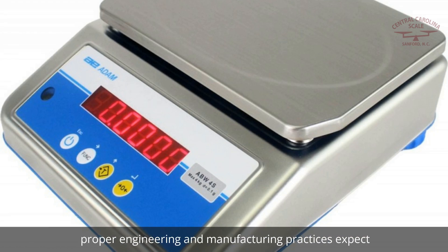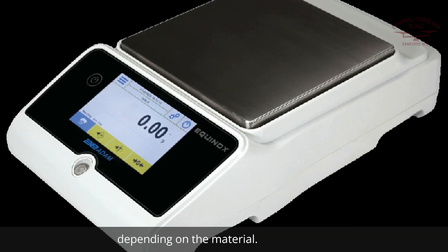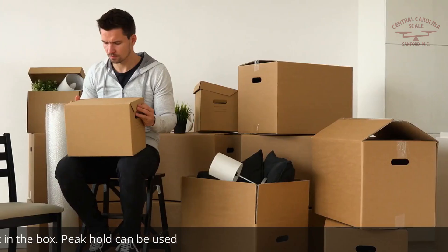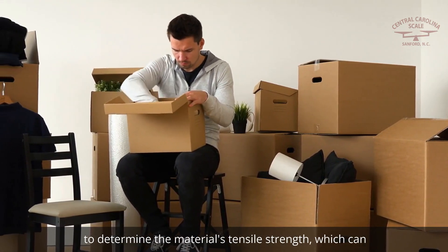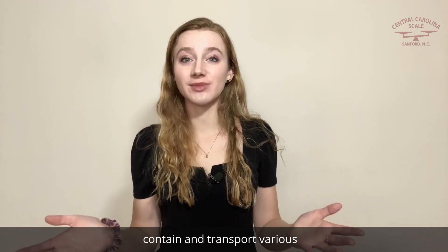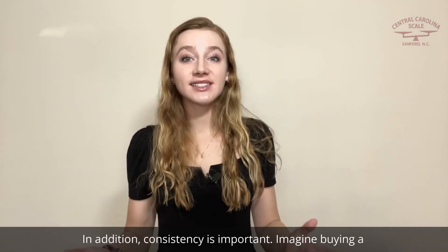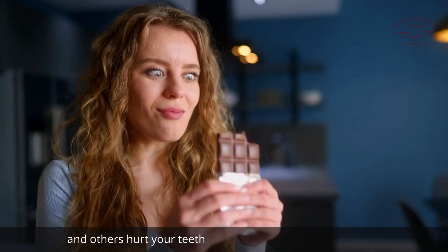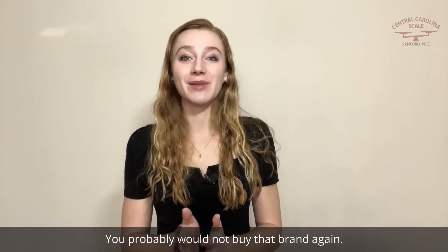Proper engineering and manufacturing practices expect a certain amount of resistance from products that vary depending on the material. For example, you don't want packaging to fall apart because of the weight in the box. Peak Hold can be used to determine the material's tensile strength, which can help manufacturers determine if a material is suitable to contain and transport various objects, materials, and chemicals. In addition, consistency is important. Imagine buying a bag of candy only to find that some melt in your mouth and others hurt your teeth when you attempt to chew them.